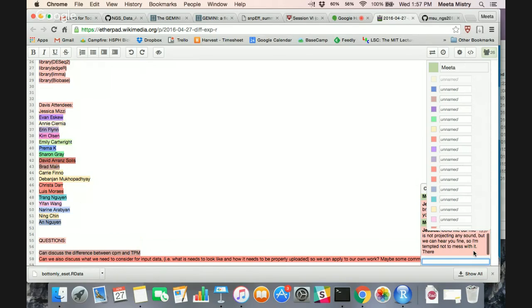Okay, cool. And in the edgeR with the different dispersion, everything I've read and used is always using the tag-wise. Is that what you guys typically use? I mean, this is what we have here, but I'm just curious if that's what you typically do.